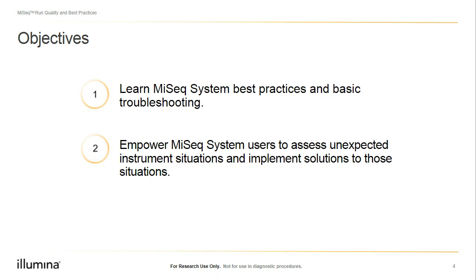So we have two primary objectives for today's webinar. First, by the end of today's presentation, we hope to have provided you with an overview of the best practices when running the MiSeq system and the basics of troubleshooting which can be performed on the system. Our second objective is to empower MiSeq users to use basic troubleshooting to assess unexpected instrument situations and implement solutions to those situations.